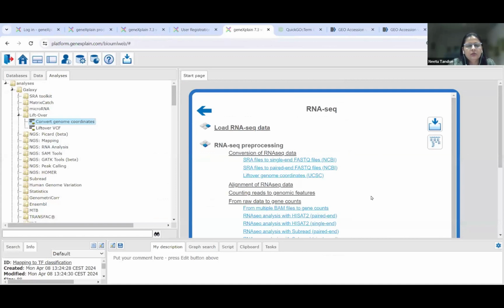And I think I answered this question. And what was the other question here? All right. So basically, yes, you can upload FASTQ files, and then there are a number of pipelines with which you can process it.